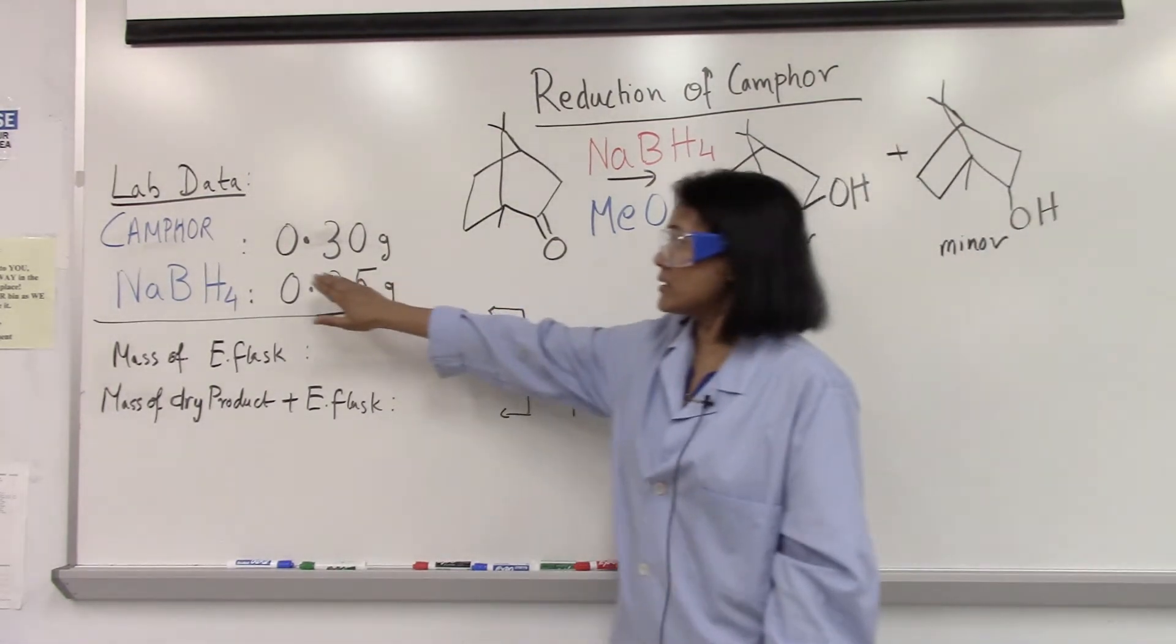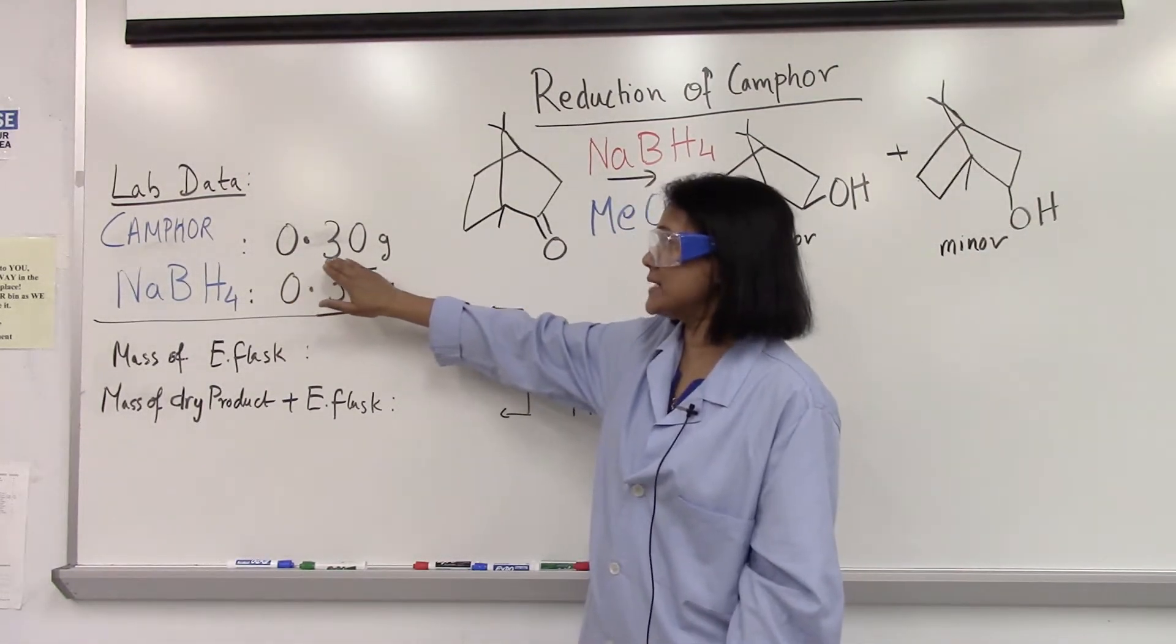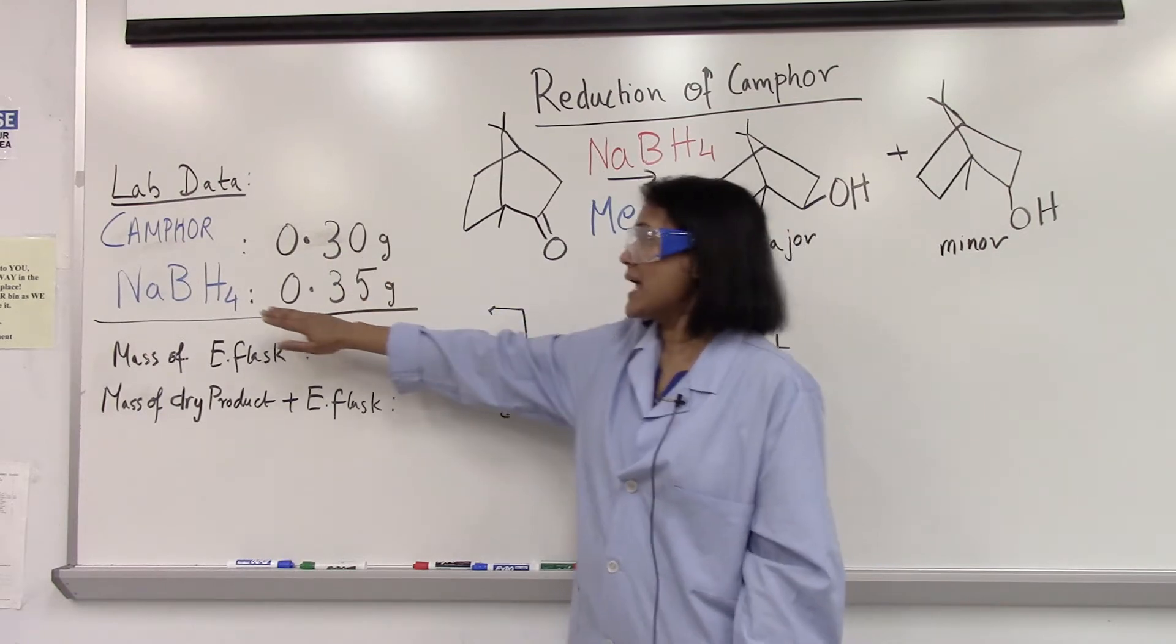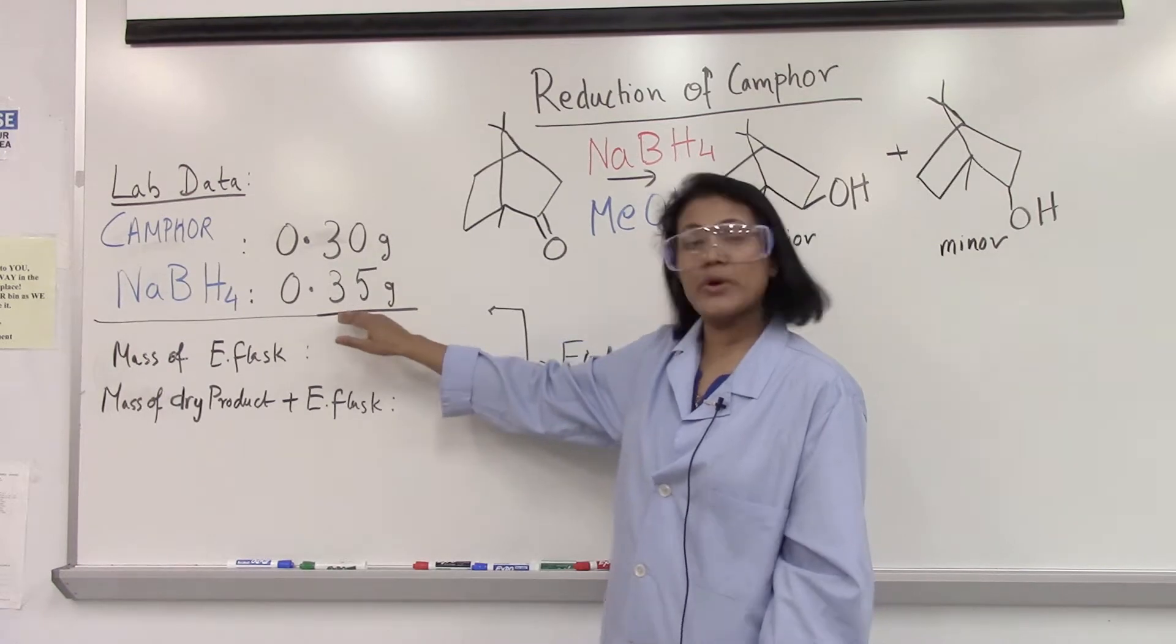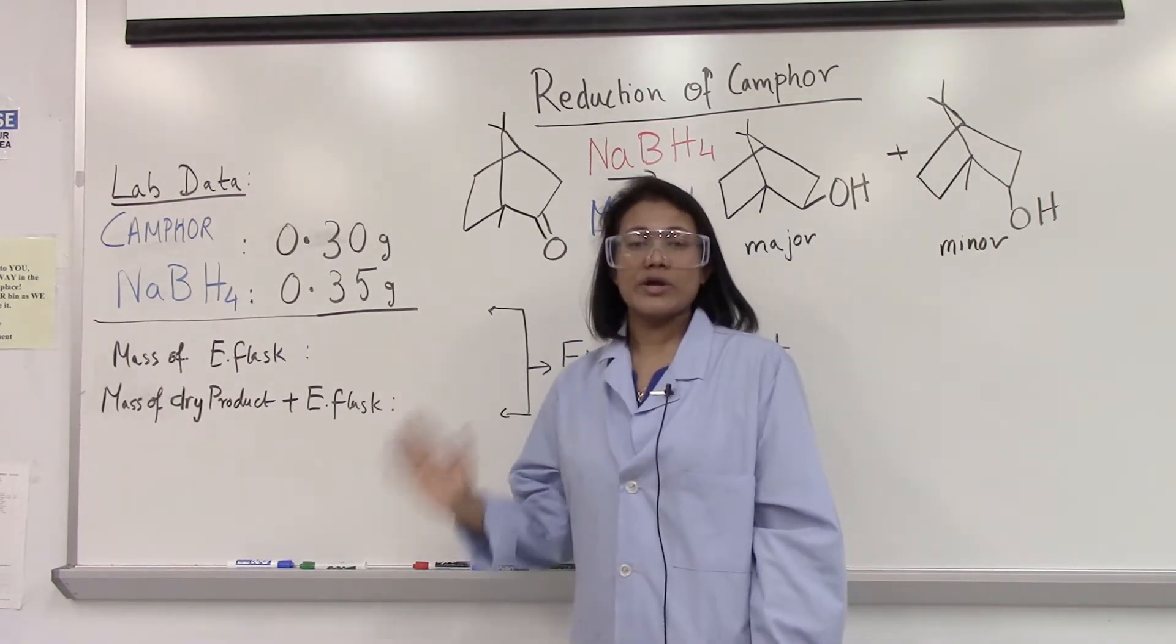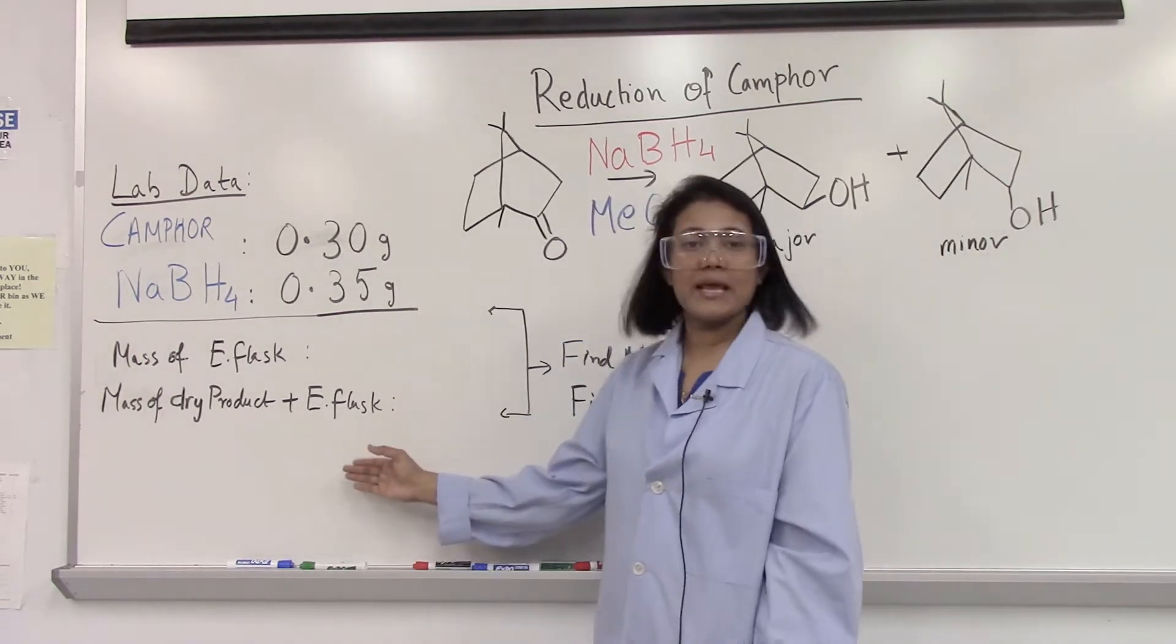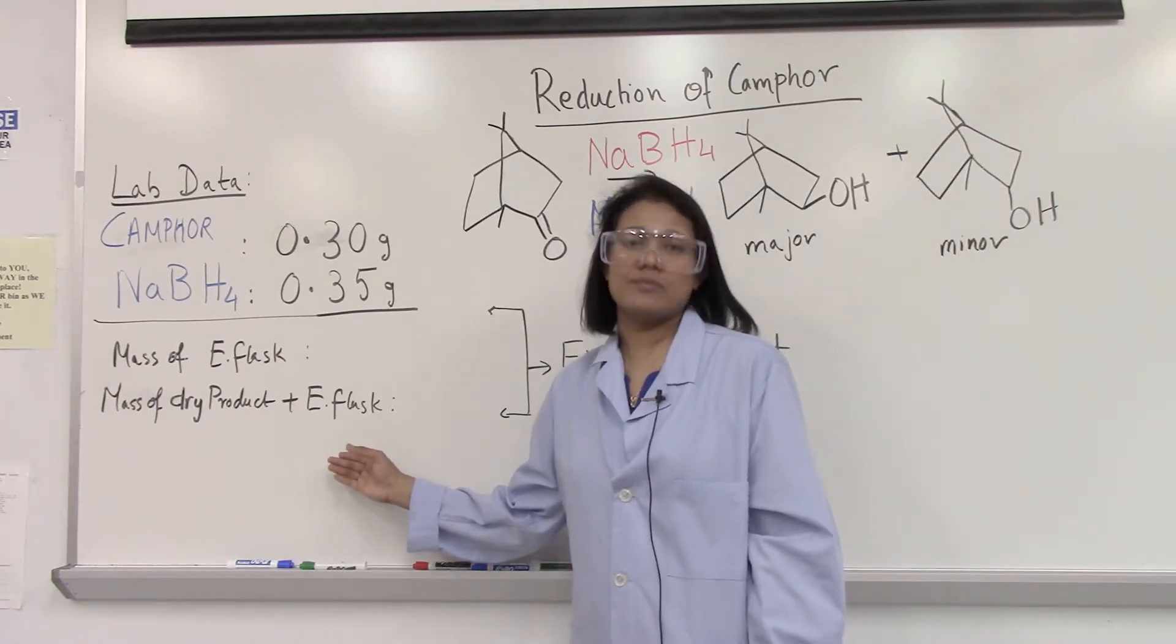I start with camphor which I weighed 0.30 grams, and reducing agent sodium borohydride I have weighed 0.35 grams. So we are going to start the reaction and at the end we are going to get the mass of the product.